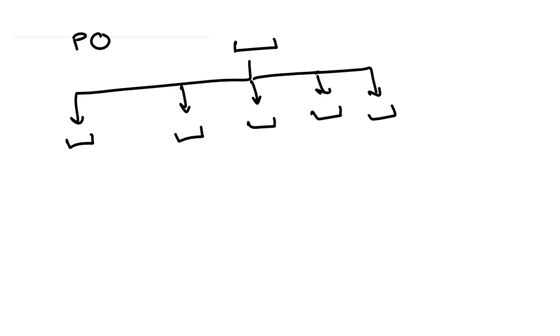So if you start out with one culture of cells, and these cells, of course, have been transformed or were already transformed, here's my plate of cells. We'll call this passage 0, because we haven't passaged them yet. Once the cells grow and the bottom of the plate is completely covered, because these are going to be of epithelial origin, you're at 100% confluency, or near it, 80-90%. At that point, you have to split the cells. So, for example, if I split this 1 to 5, these are going to be passage 1 cells at this point.